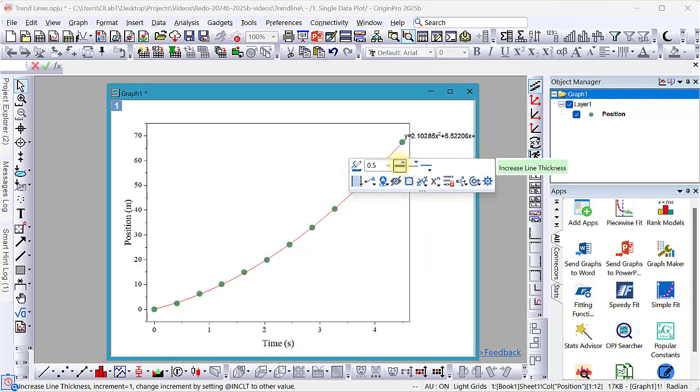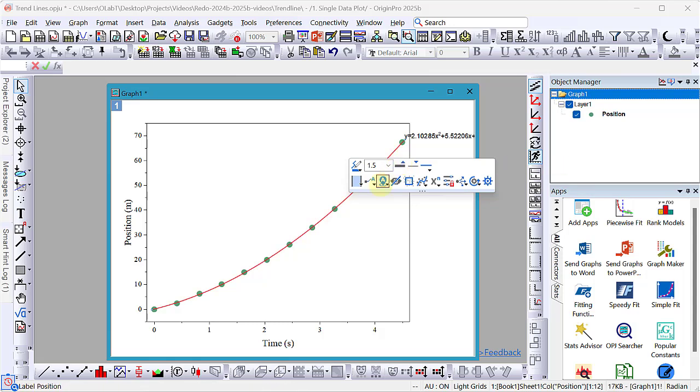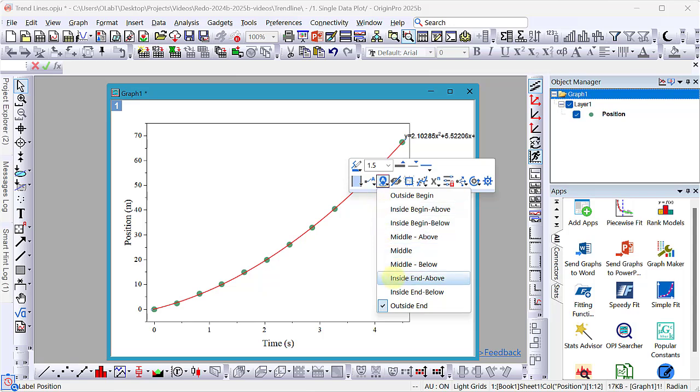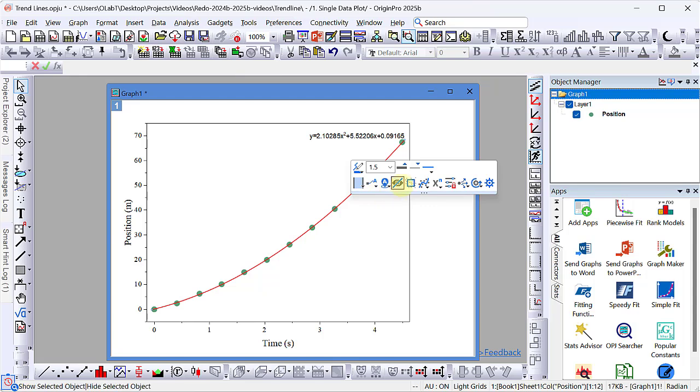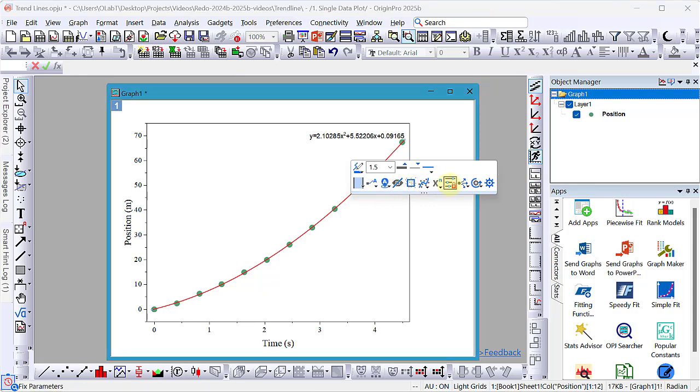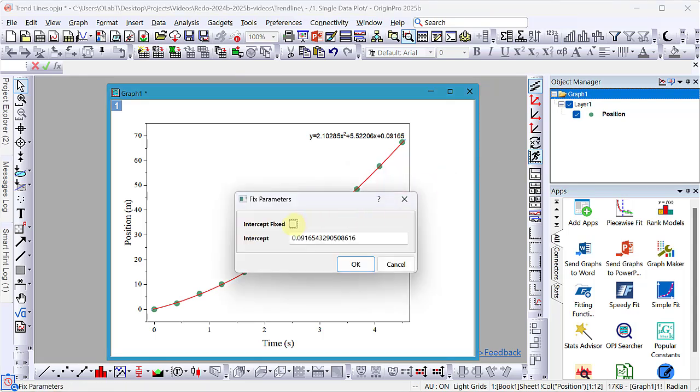Let's now move the label to be inside the layer so we can see all of the coefficients. To fix the intercept to be zero, let's click on the trend line again and this time select the fix parameters button. Let us fix the intercept to be zero.